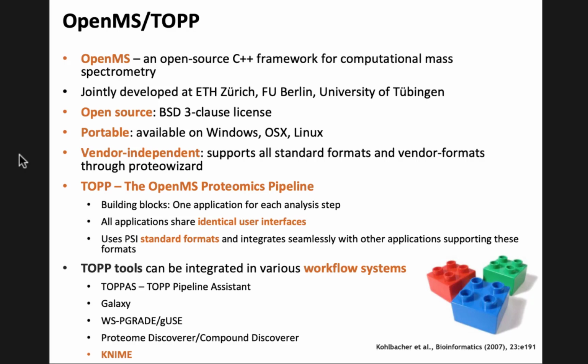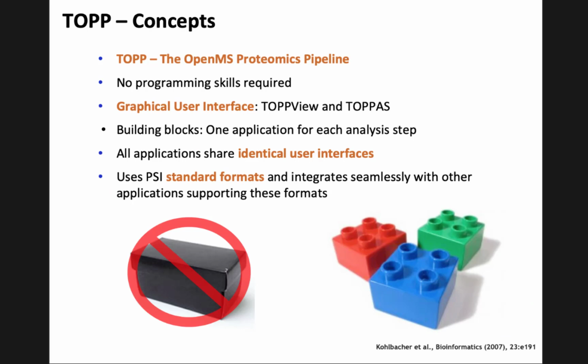They all have more or less identical user interfaces. So once you know how one of these tools works, you know how the other works as well. And you put them together. These tools are designed in a way that there is no graphical user interface for each tool, but there's one application for visualizing mass spectra, that's TOPPView. And you can run these building blocks out of these user interfaces.